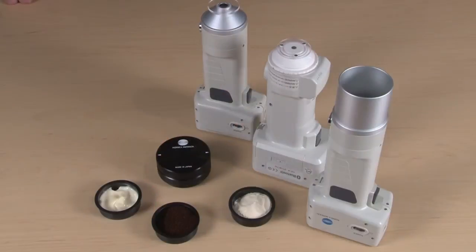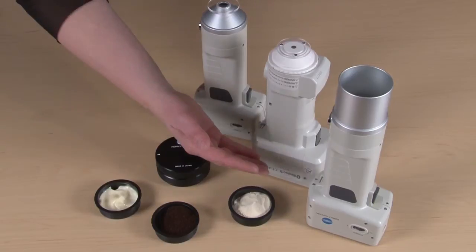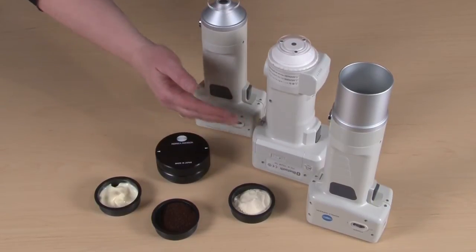Hi, I'm Jody Baker. I'm an applications engineer with Konica Minolta SunSane and I can't wait to tell you about some of the accessories that we have for our color and appearance product line. Today I'm going to be talking to you about the granular material attachment which works with our CR400 series as well as the CM700D.